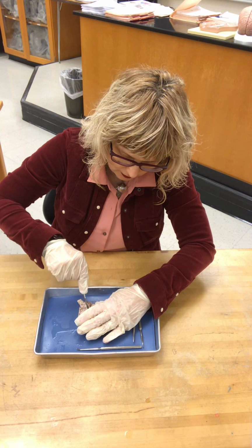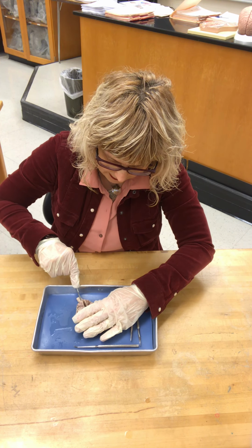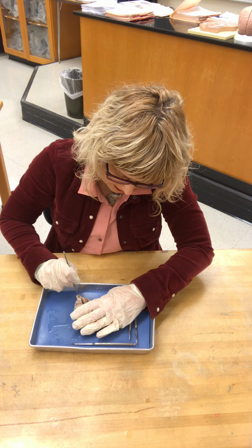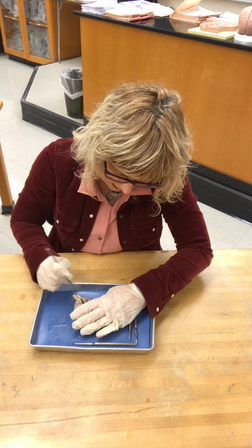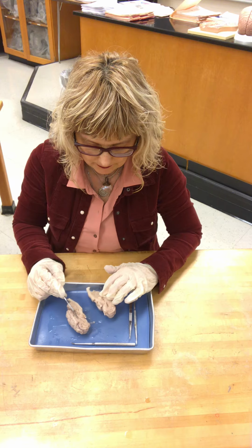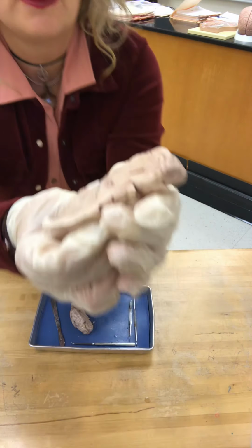Cut straight through, like cutting the cerebellum in exactly half, and then same thing with the spinal cord, which is a little bit more rubbery, so it'll take a little more effort. So what I do is I turn, so I take the tip of my blade, and voila. The tip of my blade is sharper, so that's how I end up cutting it nicely. And nice beautiful cut here, as you can see. Take a look at the brain, sagittal cut.